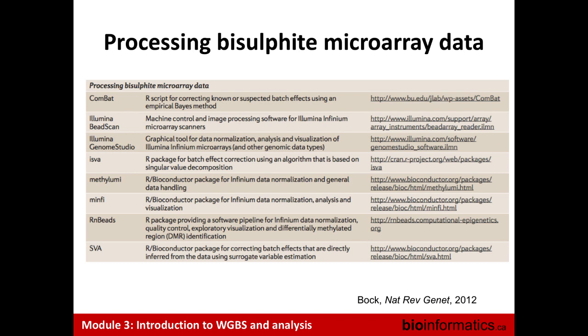So you can just use the mouse microarray. Yeah, I think you guys are stealing all of my punchline for later, but yes, absolutely. Another thing, whether it's mouse or human, is that to design a microarray you need to know the sequence, right? You don't have that in all organisms. If you're studying an organism like mouse, I would think there is a methylation array. But that's another limiting factor.